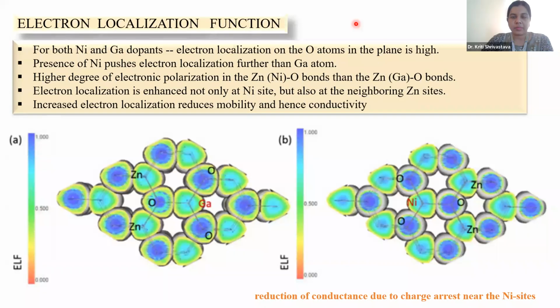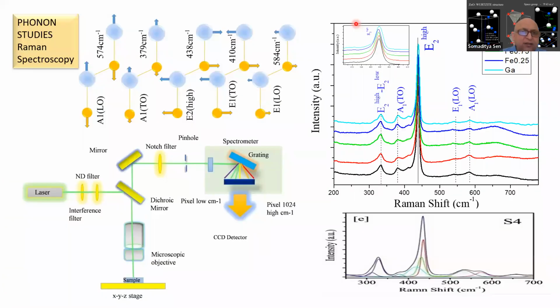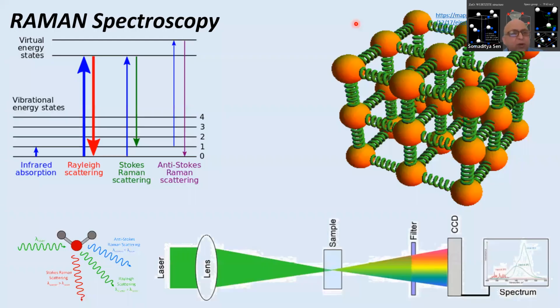So the vibrational spectra can be probed, but let me go to the slide. In FTIR, what we do is we shine the material with direct light, which is in the IR range. This is infrared absorption. I've written it here. So infrared absorption means it's the FTIR. Now there's a physics behind it which says that both of these things cannot go simultaneously together, but it is not absolutely correct.